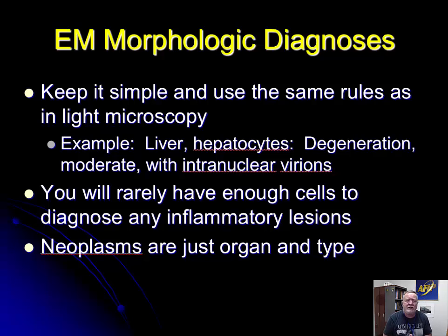And when you have a tissue that has a tremendous amount of damage, let's go back to that chimp liver with adenovirus, and so many of the cells are destroyed, and then you take it out of a paraffin block where, even on the best of the cells, you have large areas of artifact, or areas where the osmium doesn't cover on an even basis. So people want to interpret these. And I would say that 9 out of 10 images that come to me, people are making interpretation on either stain artifact or something that they are too close to, or that is too damaged as the result of processing to properly identify.